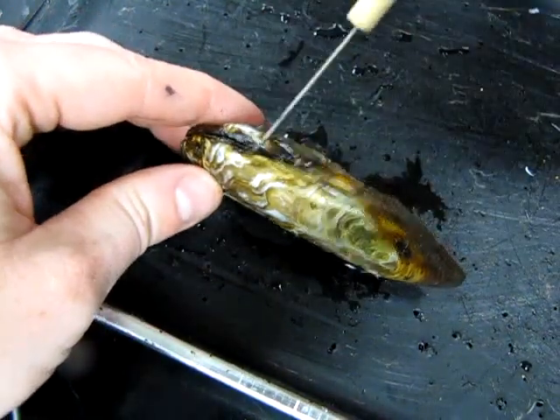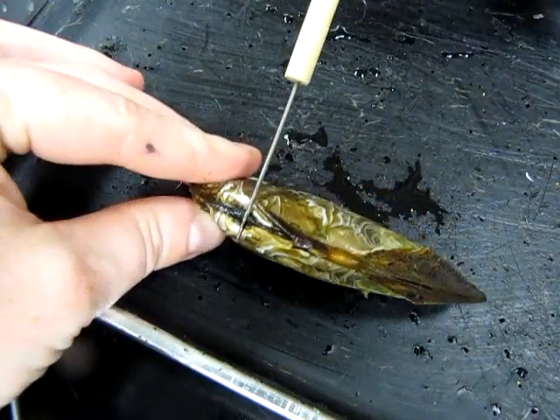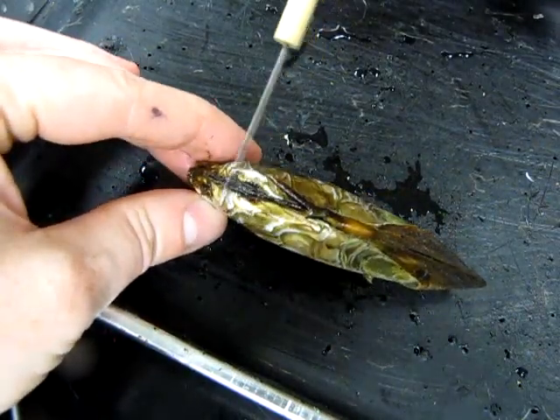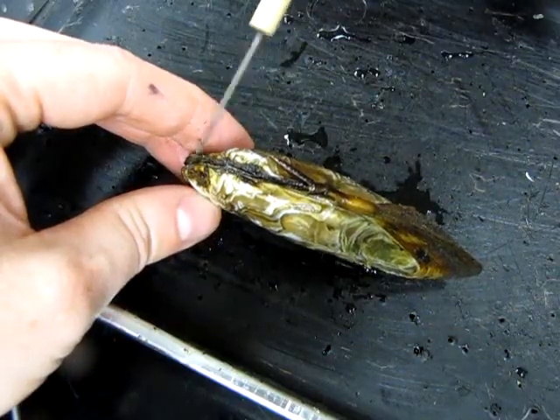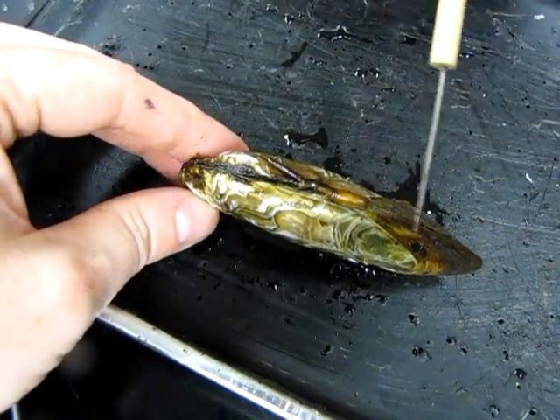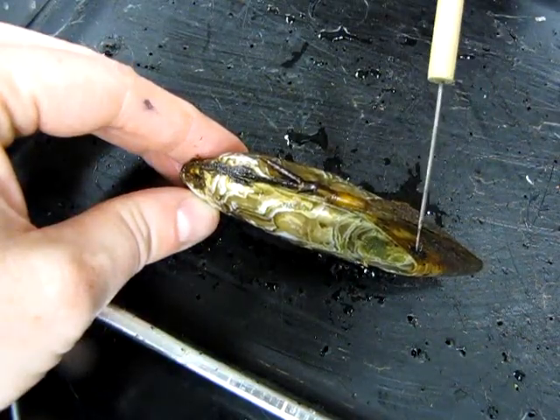Here's the umbo. You'll notice it's not quite at the center of the animal. This shorter side in front of the umbo is the anterior side of the animal, which means that this longer side here is the posterior side of the animal.